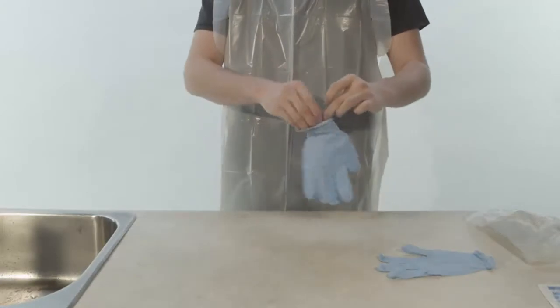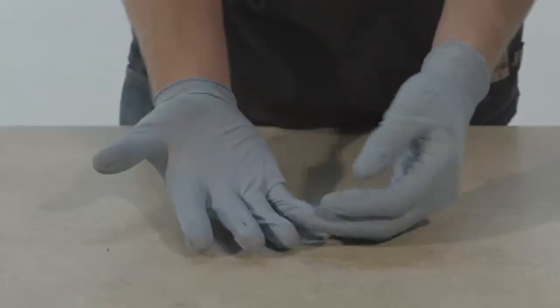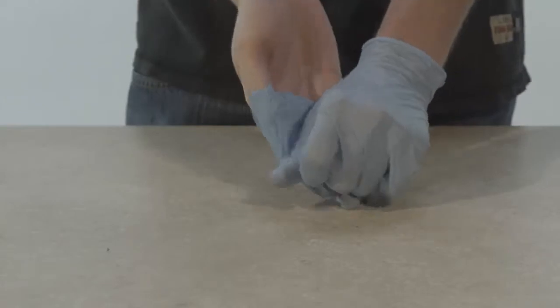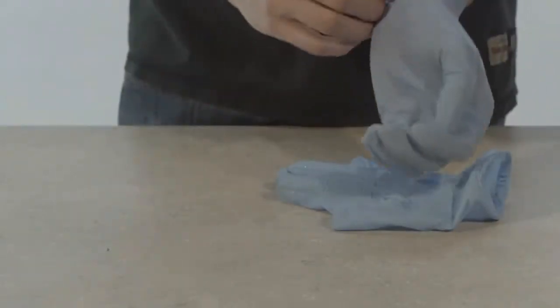Gloves often prove to be the most used piece of safety equipment and the most easily damaged. Immediately change damaged gloves and inspect them regularly while you experiment.